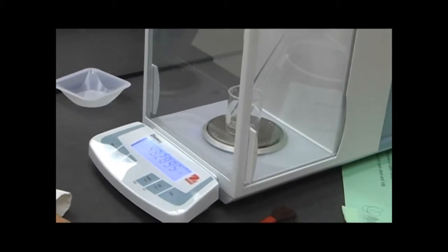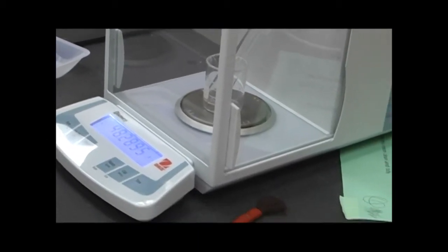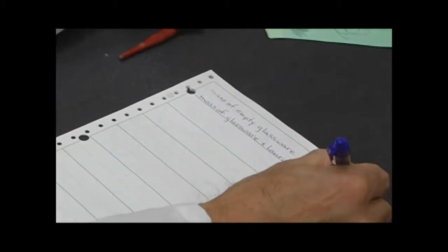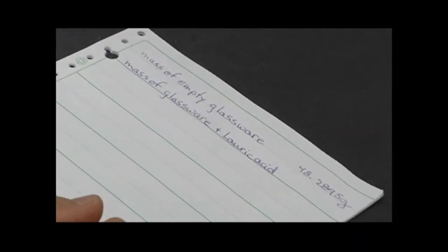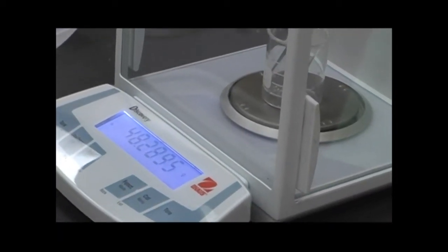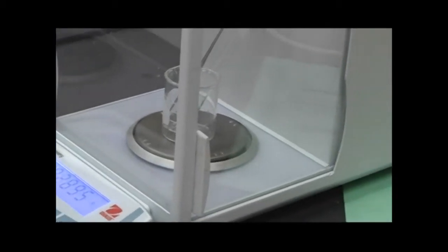So we'll record that mass of empty glassware. Remember to record all digits, even if the last couple are zeros. And now we'll return to the lab, placing some lauric acid into the glassware, and then coming back and weighing the glassware and the lauric acid.